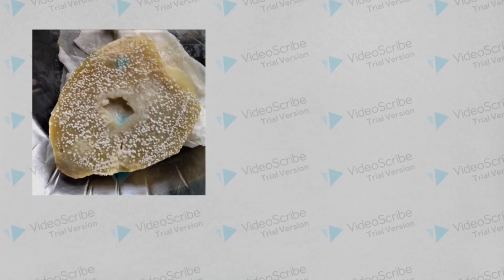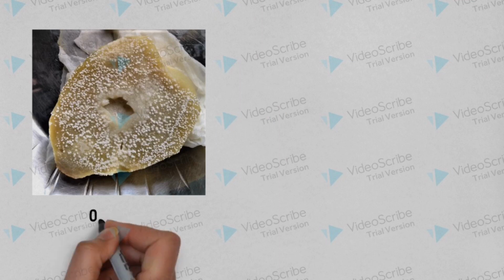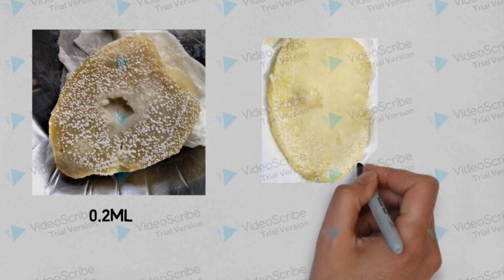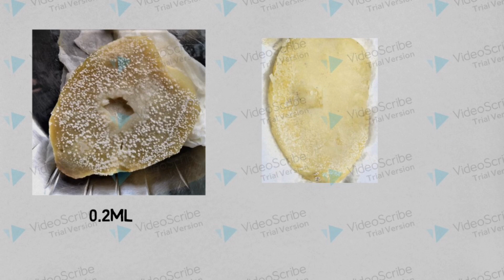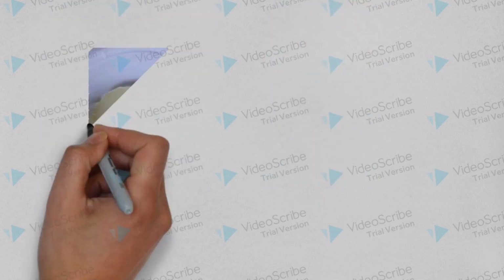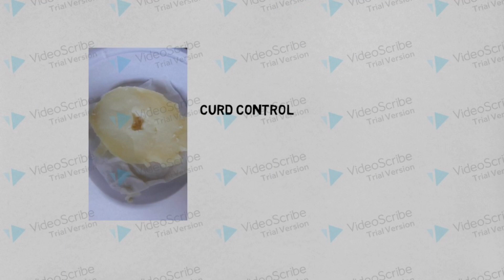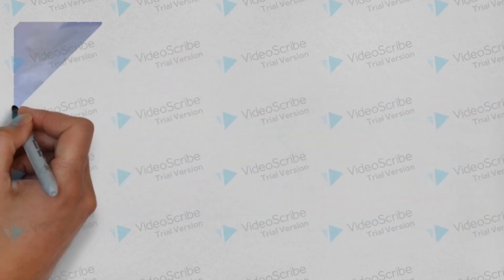Proceeding to the next part, we observe a zone of inhibition on both the test potatoes, which was an obvious guess. Here, we spot a small zone of inhibition in the less concentrated sample and a comparatively larger radius in the latter. But we see no inhibition in the antibiotic control and the curd control, proving that our hypothesis was right.